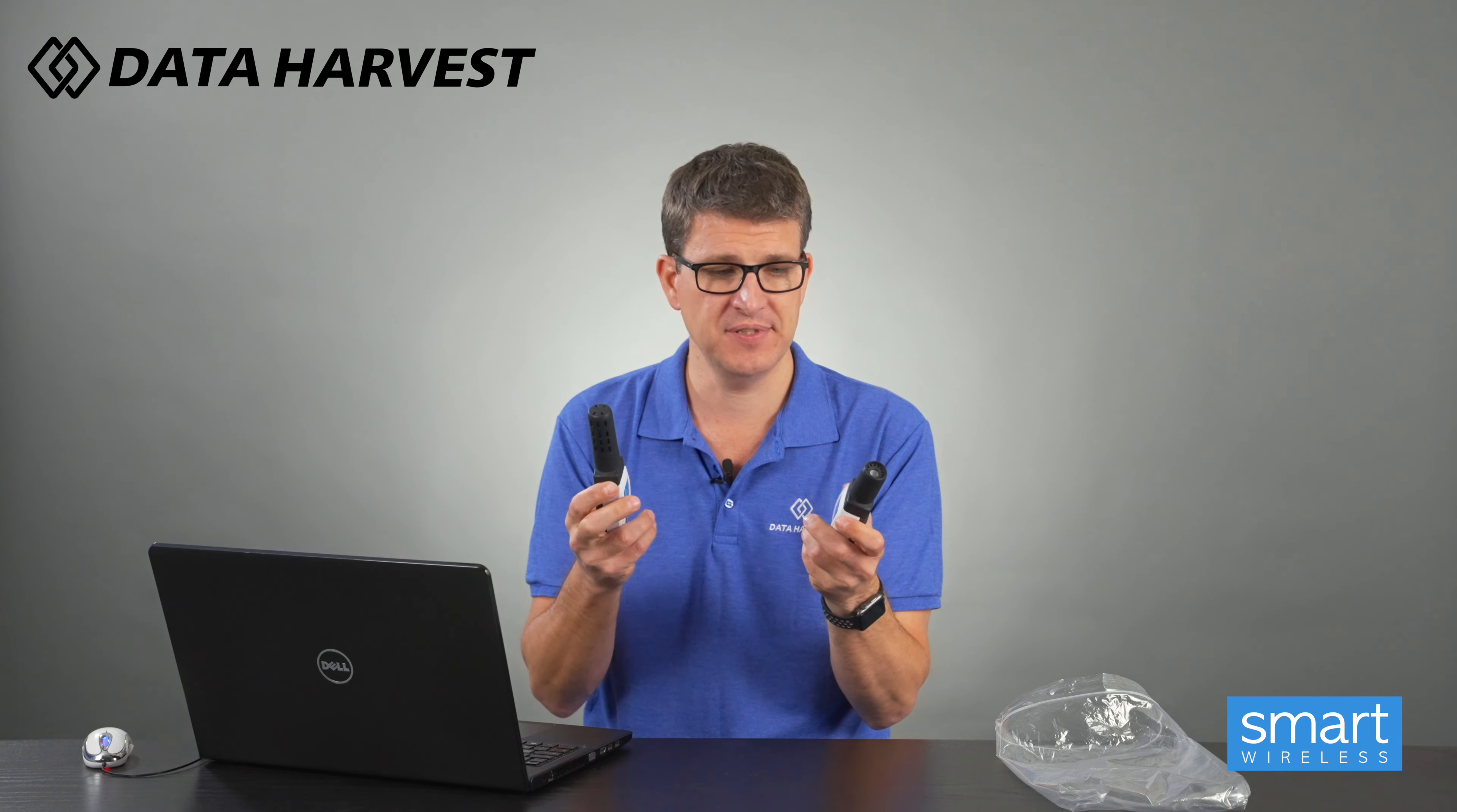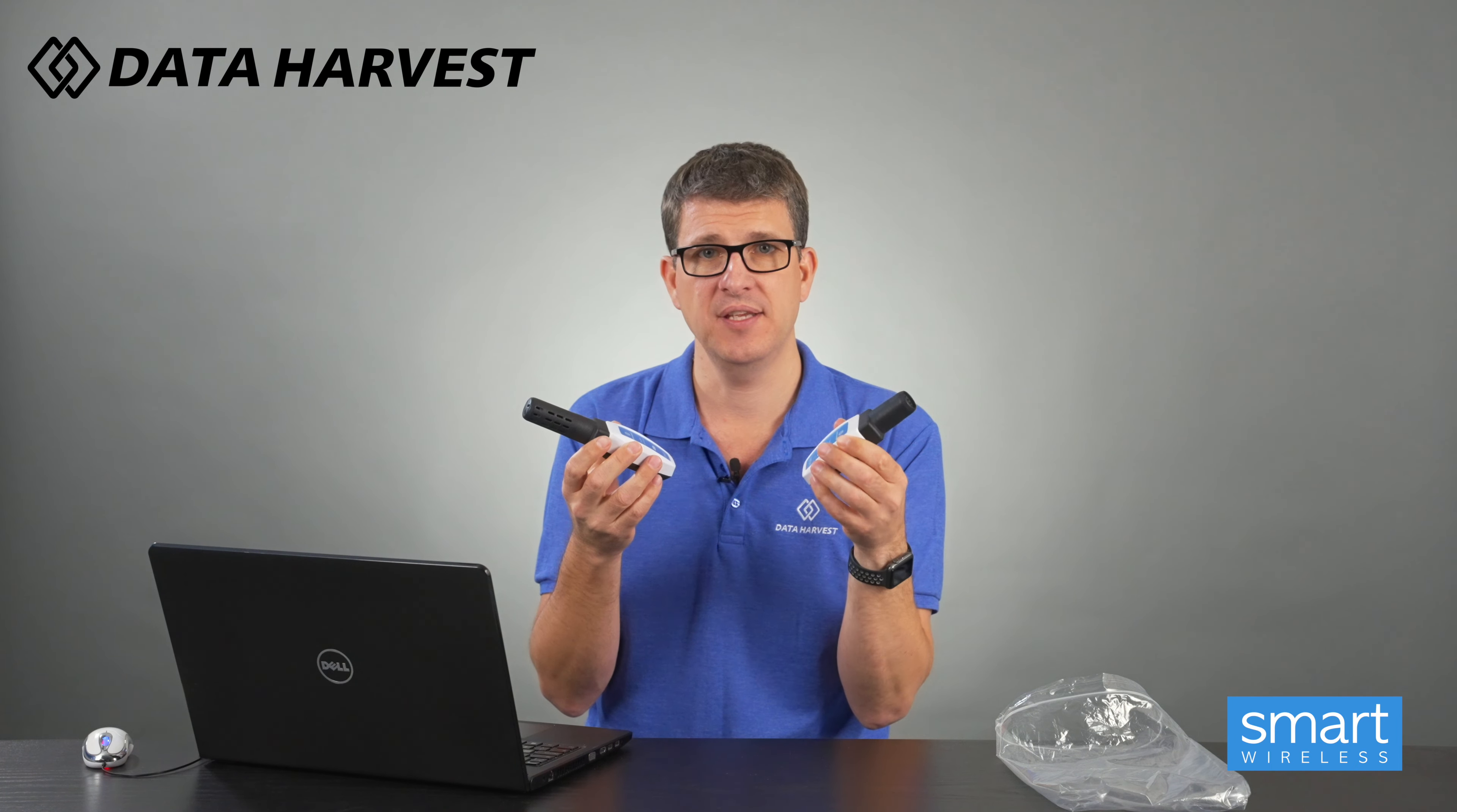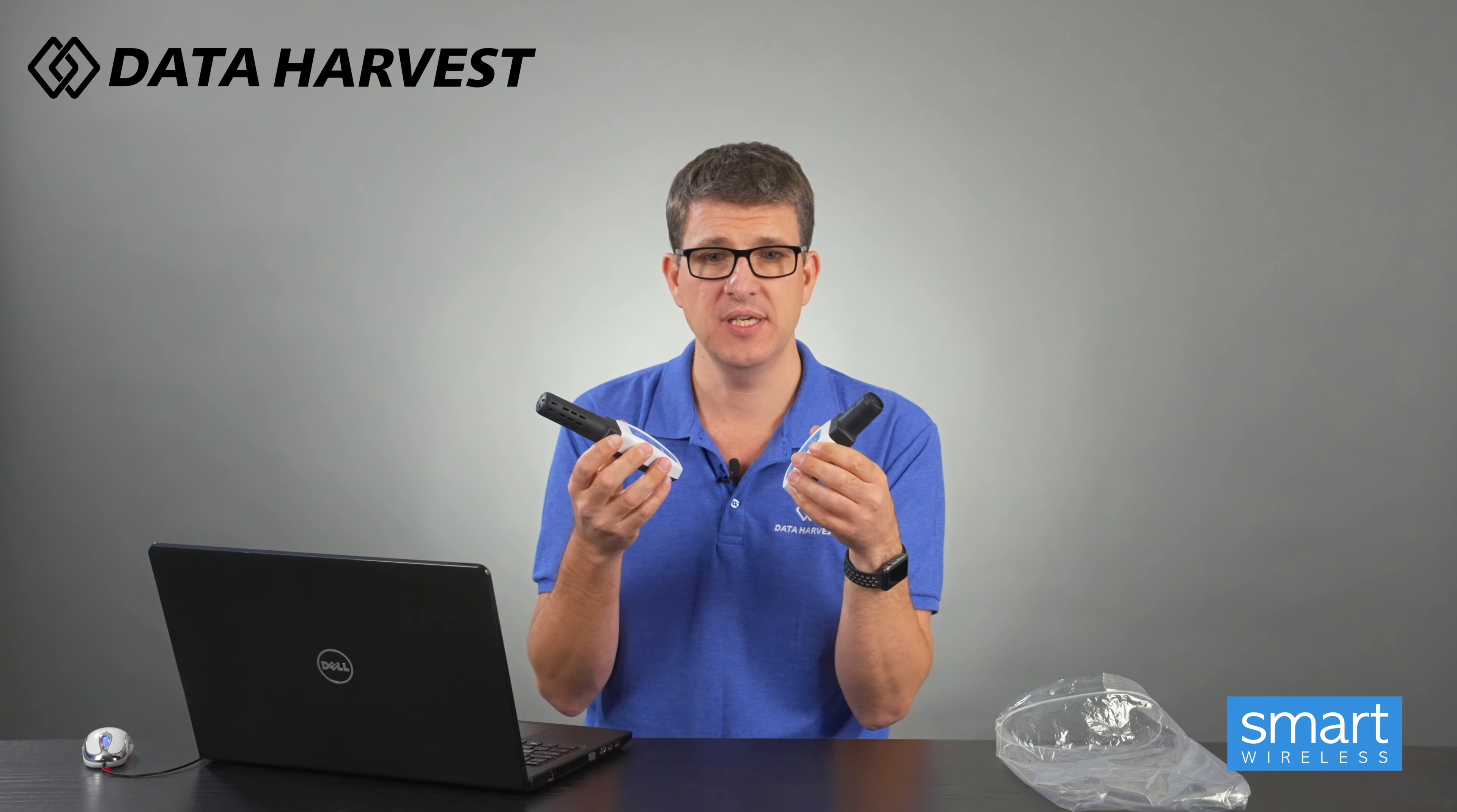So with our Bluetooth sensors, the USB and Bluetooth built in, lots of other things the CO2 and the O2 sensors can be used for.